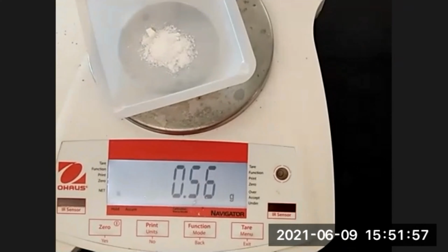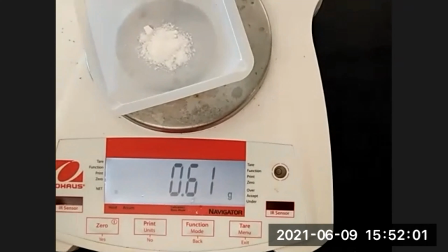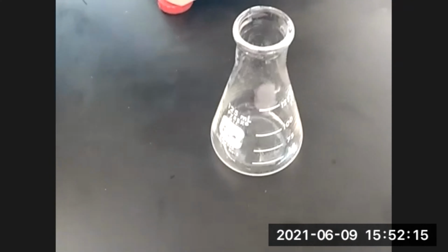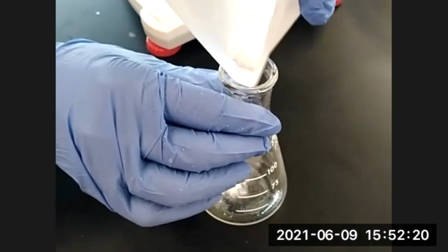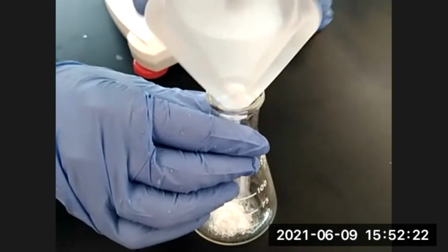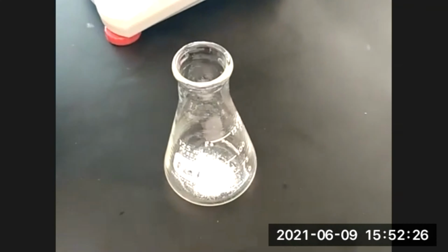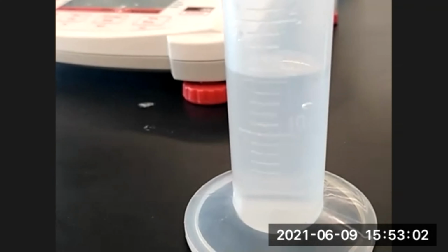So for this example, we're going to be using 0.6 grams of sodium bicarbonate. Then you're going to add it to a 125 milliliter Erlenmeyer flask and dissolve it in 15 milliliters of water.